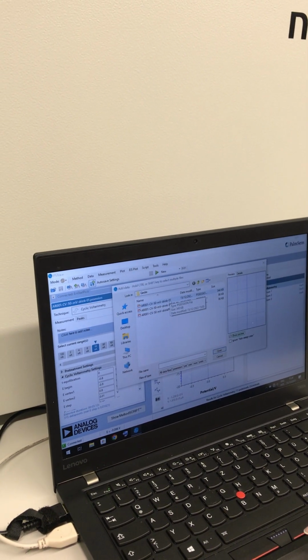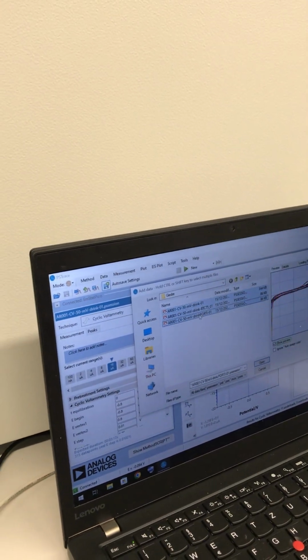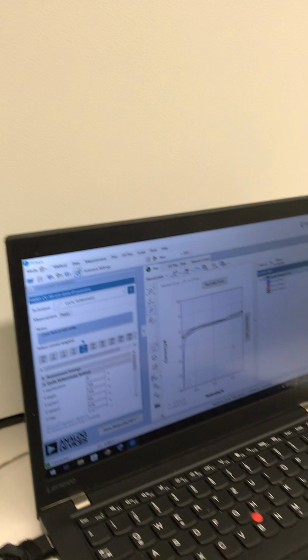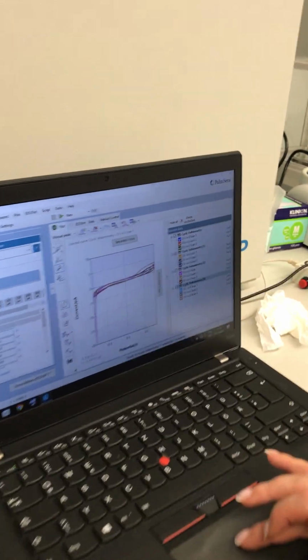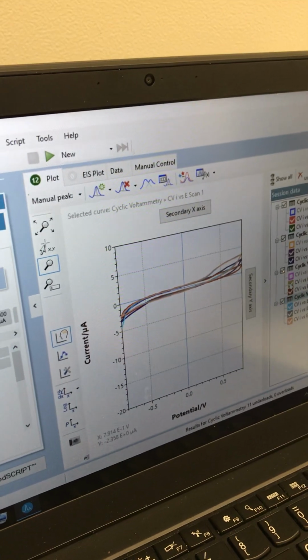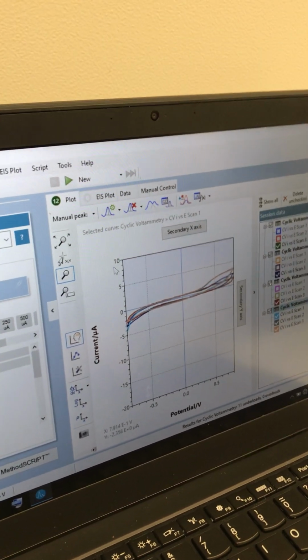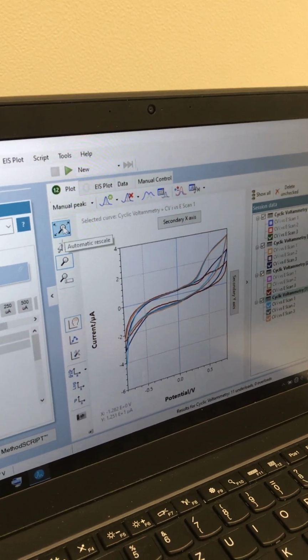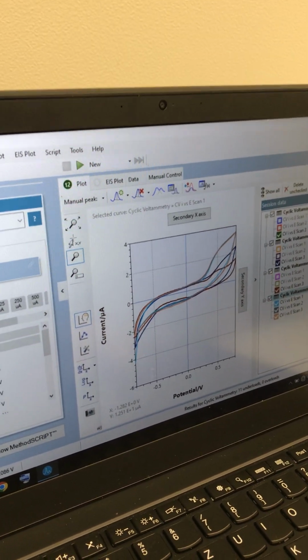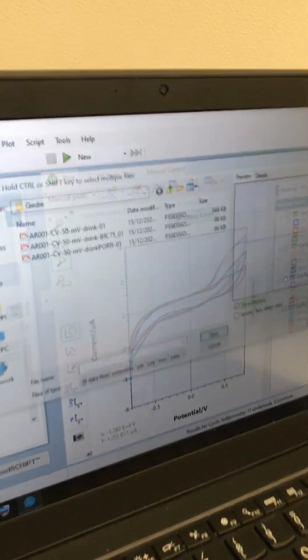And how do I make sure I have all of these overlaid? Usually I take the first scan out because we don't need much from there. So that's the overlay of the unknown alcohol, then the Finnish whiskey from today, and the really old whiskey. We'll add a control maybe. The best control would be ethanol.